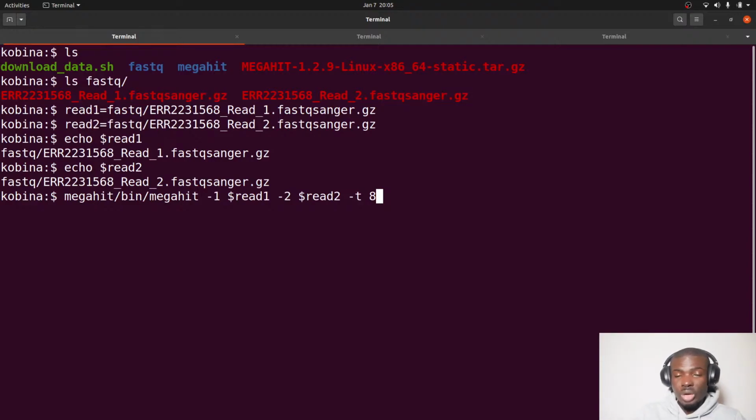I tried it. That's how long it took. So if you're going to use -t 8, then it's going to take you probably about an hour and a half. So just take note of that. If you have more than 8 cores, you can increase it. Maybe you have 30 or 38, but just use 8 if you're using your normal laptop. Or better still, just use an HPC cluster to save you all these inconveniences. So -t has been done. Let's look at the other options.